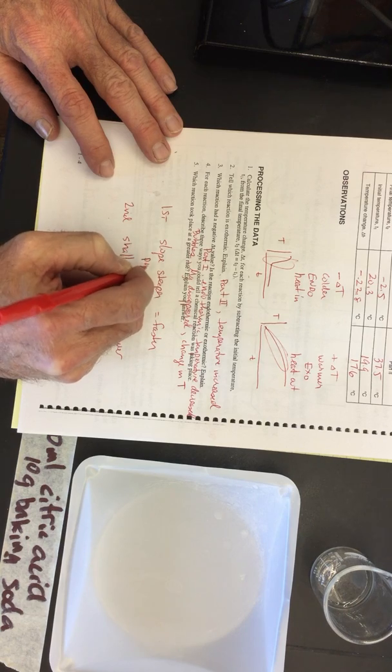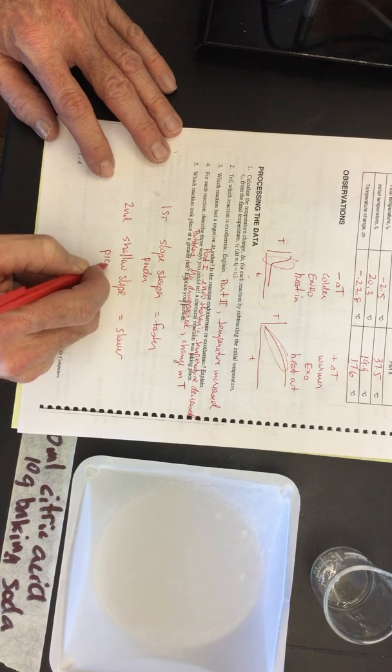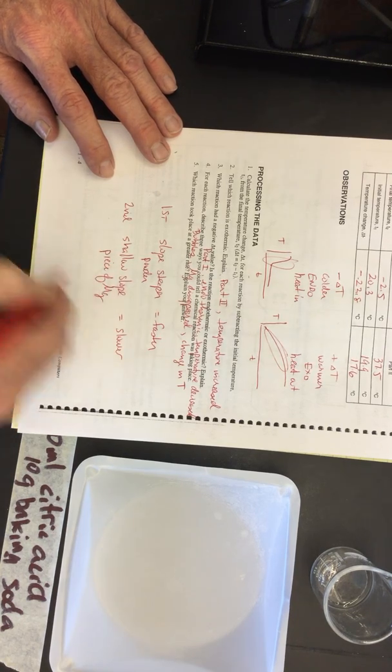So here's the question. Explain your answer. Which took place at a greater rate? This took place faster. Question is, why? I started off with baking soda, a powder, versus the magnesium, which was a solid metal strip. Can you guys see where this is going? We have a powder versus a piece of magnesium.